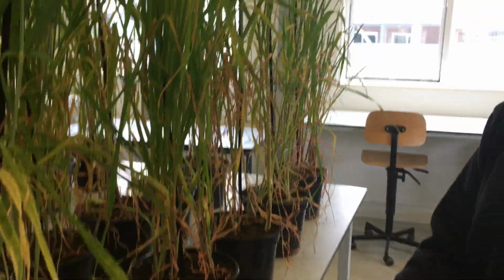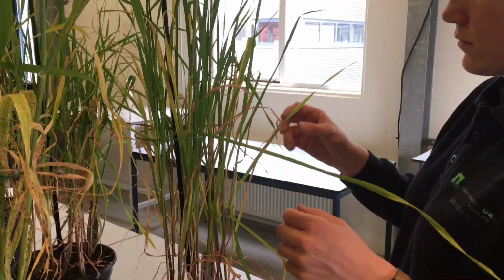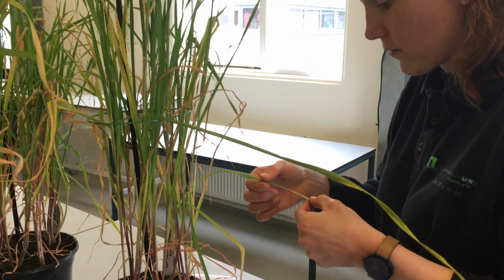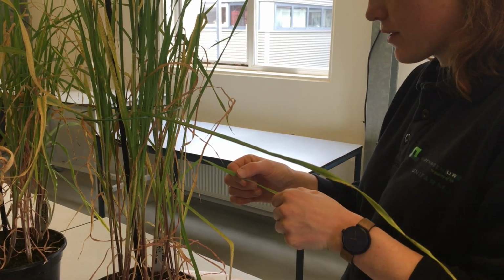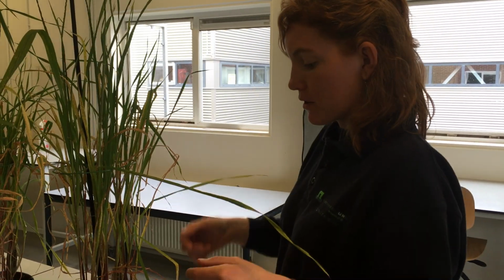Shall we take Fada to have a look? Sure. That's the last pot. Fada is a bit resistant or tolerant. You have to make the conclusion. Yeah, it has a lot less pustules on the leaves. Okay, and this might be 20%.